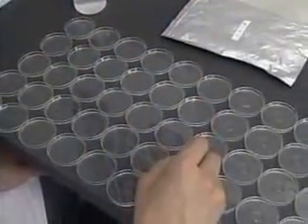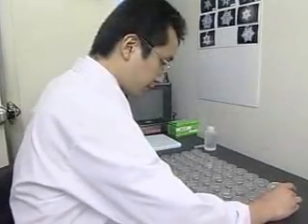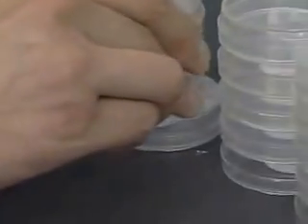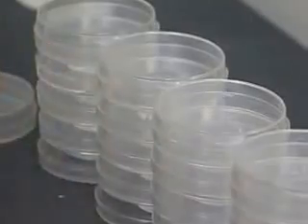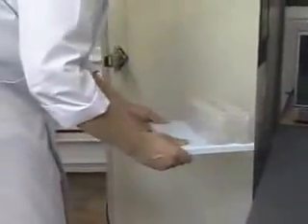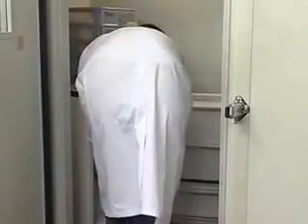In order to obtain a more accurate crystallization trend, we create 50 frozen samples of every water specimen. The petri dishes are placed inside a freezer in the laboratory and frozen at -25 degrees centigrade.